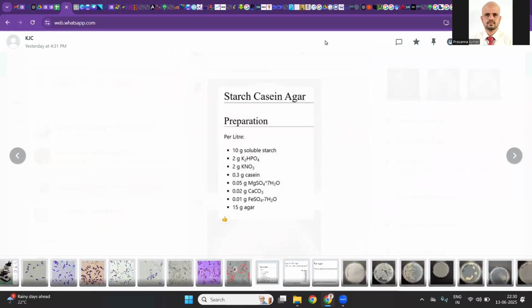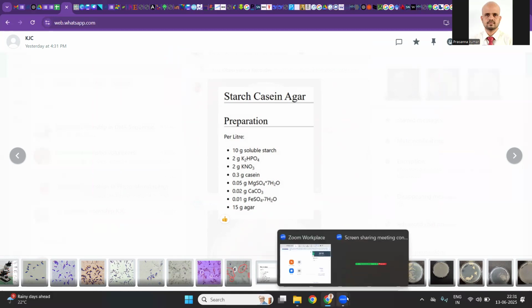Very happy that the interns can pick this up even from day one. We are inoculating samples today. I will update you with the results tomorrow.